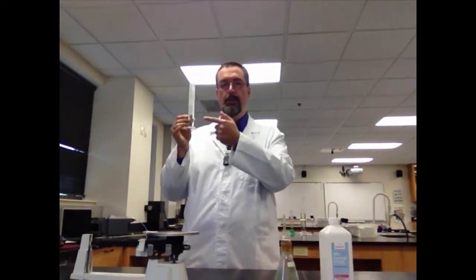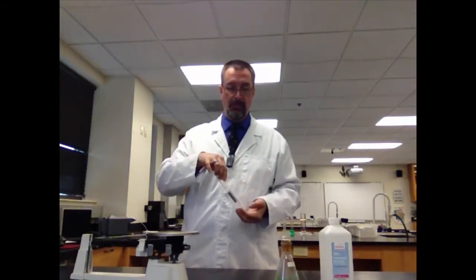Make sure that you are very, very careful with the uncertainty of this particular instrument and that you have the right number of decimal places. Now, you've used the graduated cylinder before, so that shouldn't be an issue.